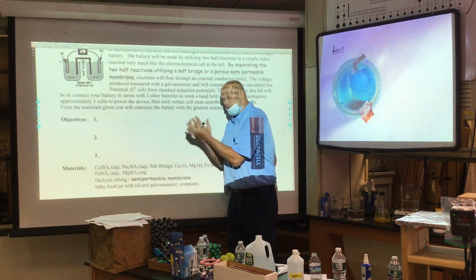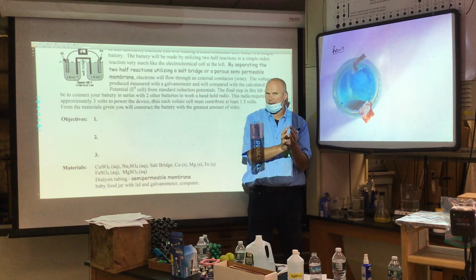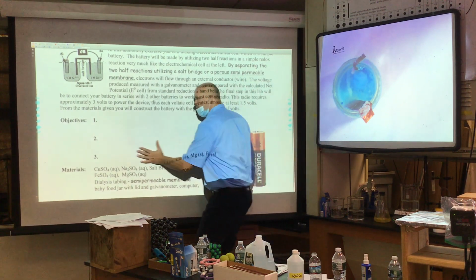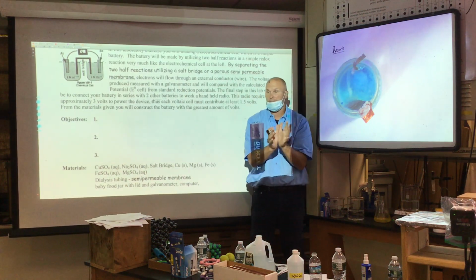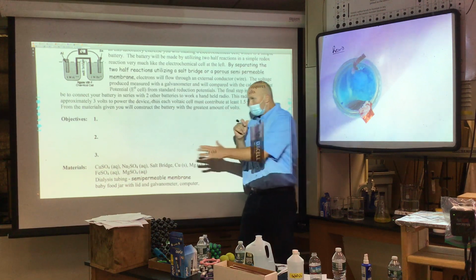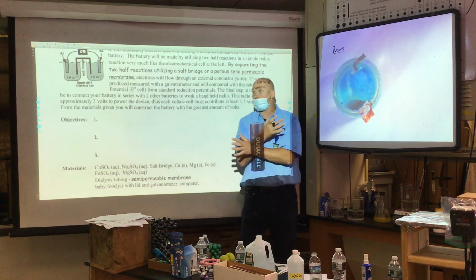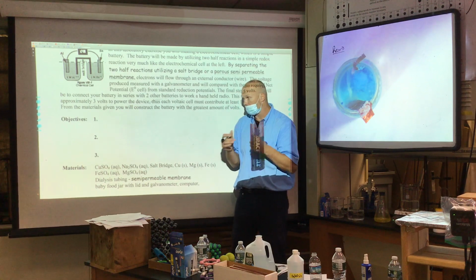We see how close our experimental value was to what was on the net potential table, which we know has limitations, right? It's based on a set of conditions that we definitely were not at. This is really important. It's this part right here that we're focused on, the error. Error analysis is big. It's from the errors, party people, that we learn about the chemistry, because all experiments have limitations, but the percent error, or the analysis of our errors, leads us to a direction where we better understand the chemistry, or how the atoms react. It's really important that we embrace the error, okay?